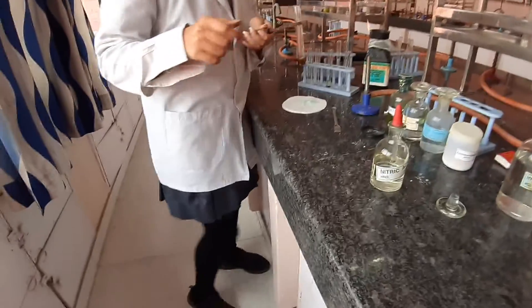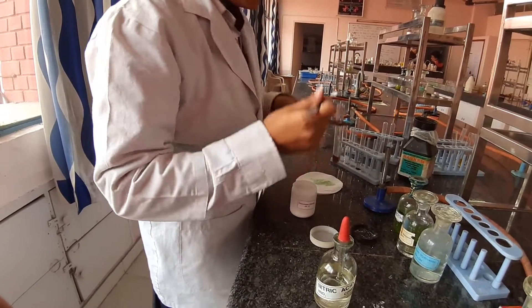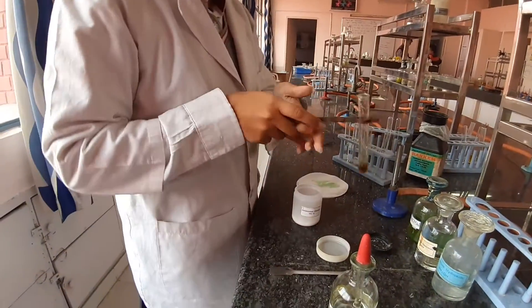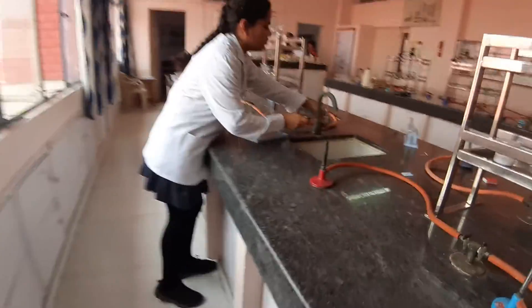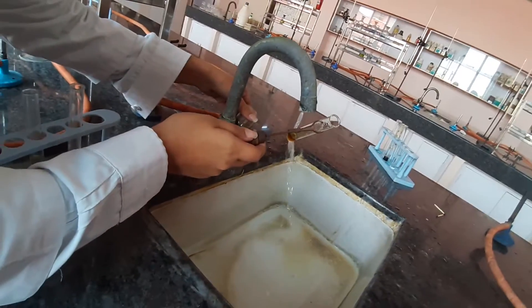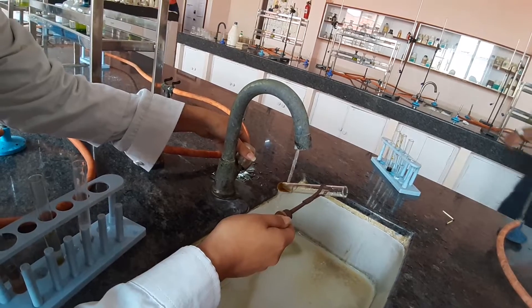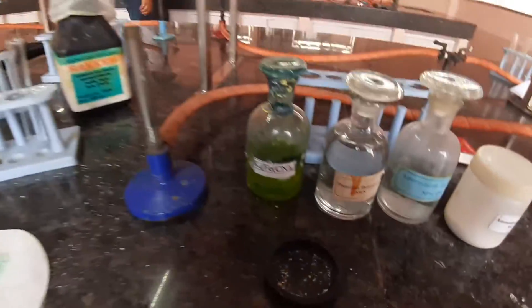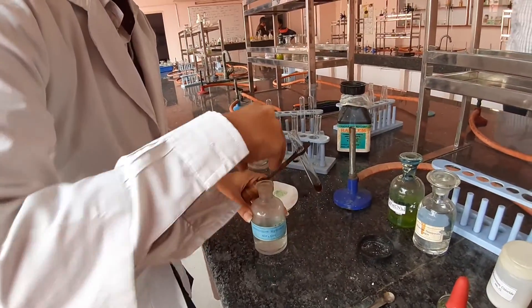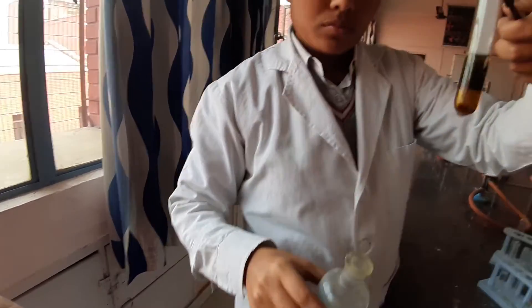Ammonium chloride solid is to be added with the help of a spatula. Shake it to dissolve, and then cool it before adding ammonium hydroxide — you can use the tap to cool it. The cooling is done because ammonium hydroxide is nothing but ammonia dissolved in water, so if you add it to a hot solution, ammonia would escape. So always ammonium hydroxide is to be added after cooling the solution. Add ammonium hydroxide and observe carefully — you are getting a PPT. This PPT is reddish brown in color.